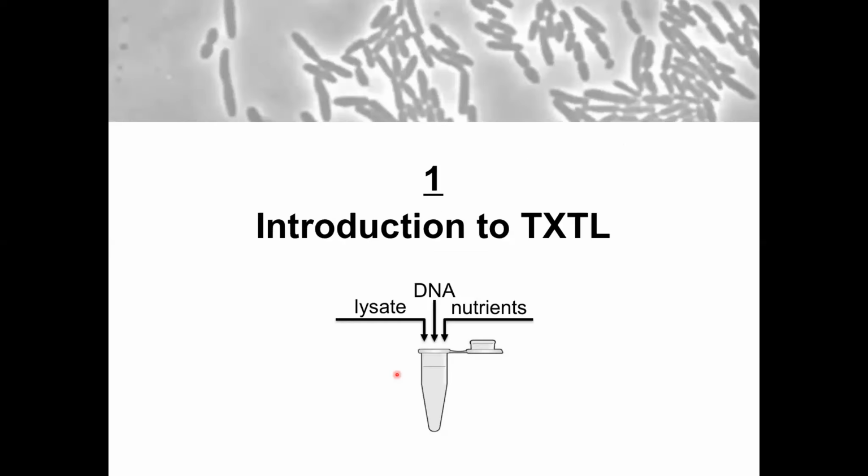That's it. So let me introduce TXTL. TX is for transcription, TL is for translation. It's cell-free transcription translation. There are other words for this, like CFE, cell-free expression, and IVTT, in vitro transcription translation. Just use TXTL. It's as practical, I would say.